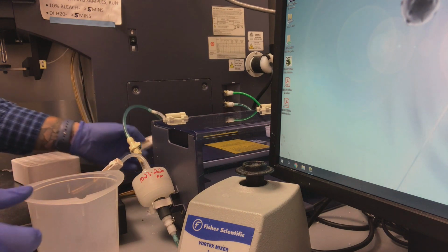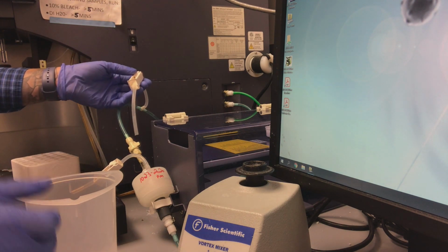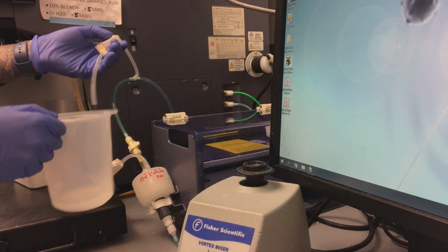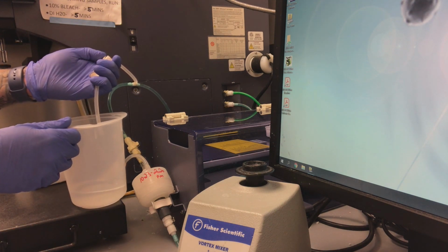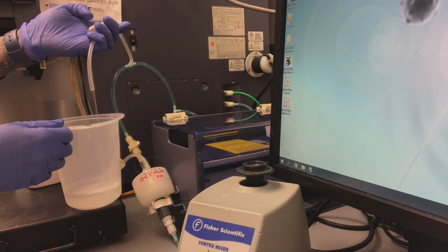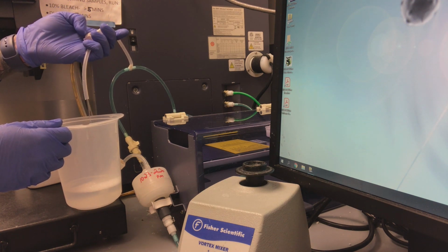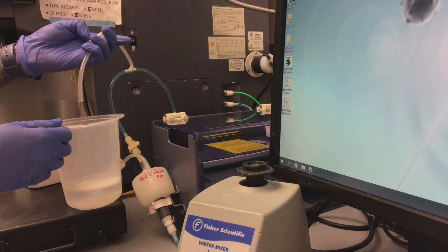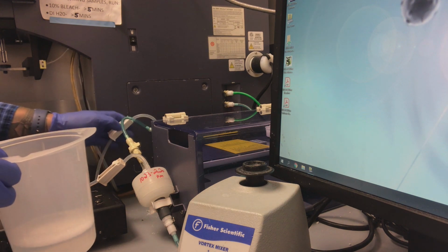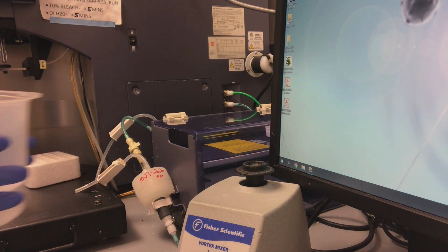There's another roller just upstream of the tubing that's going into the cytometer. Please follow the same steps. If there's no evidence of air, we can roll this back up into place. You can empty the beaker into the waste or down the sink.